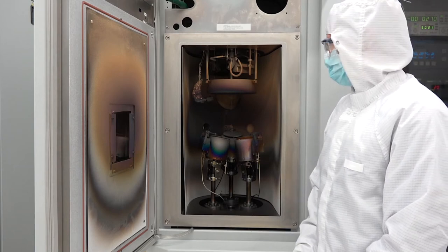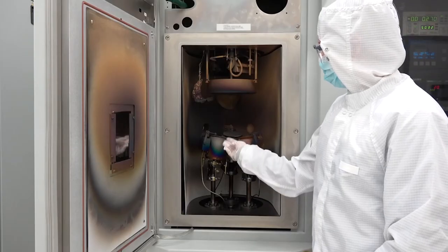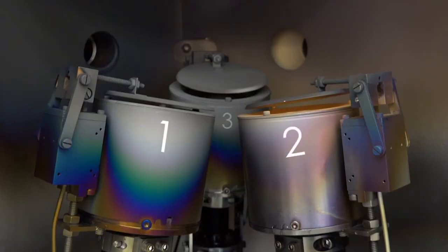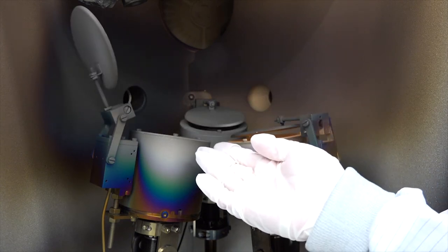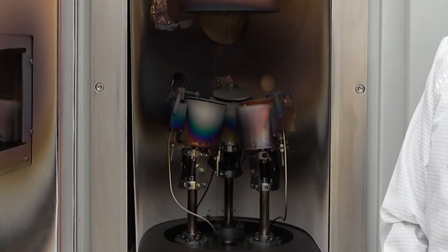The third component is the target, located under this movable shutter. The target is the material we wish to deposit. For example, this target is titanium. Note that this system has a 3-target capacity, so we can deposit up to 3 materials during a single sputtering process. The shutter can block sputtered material from the sample. We can open and shut the shutter to quickly start and stop deposition to achieve precise thicknesses. When the shutter is closed, no deposition on the sample occurs. When the shutter is open and the plasma is on, then deposition occurs.